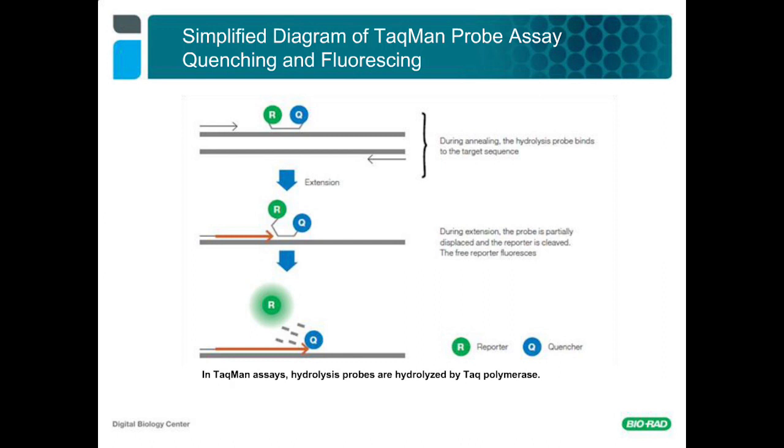Balancing temperature, assay concentration, and primer probe length are important when designing an assay because in an enzymatic reaction, the components are dynamic, coming on and off the DNA. Since all components have an on and off rate, keeping the amplicon length short increases the number of polymerization events that will finish and thus make a complete amplicon without the polymerase falling off.